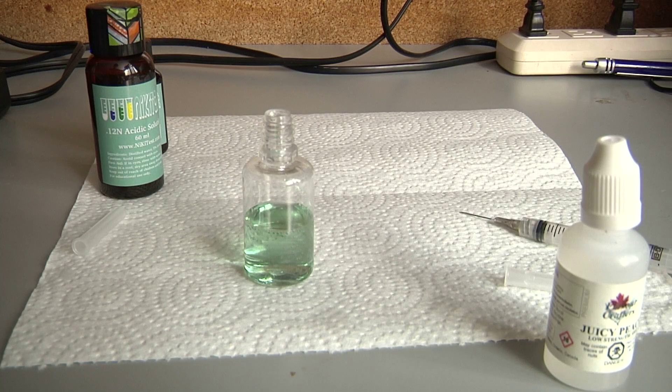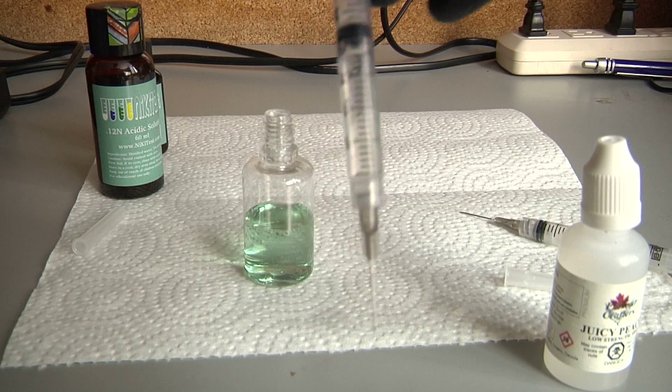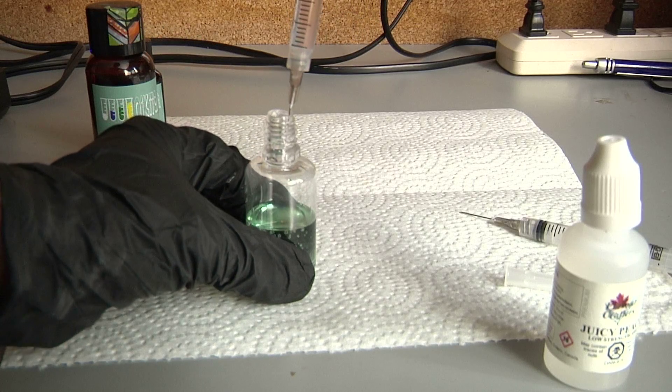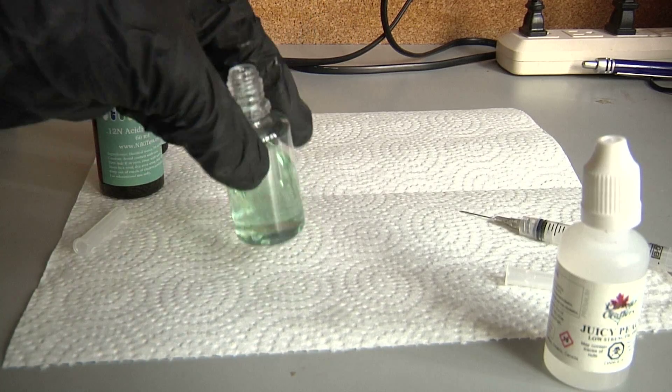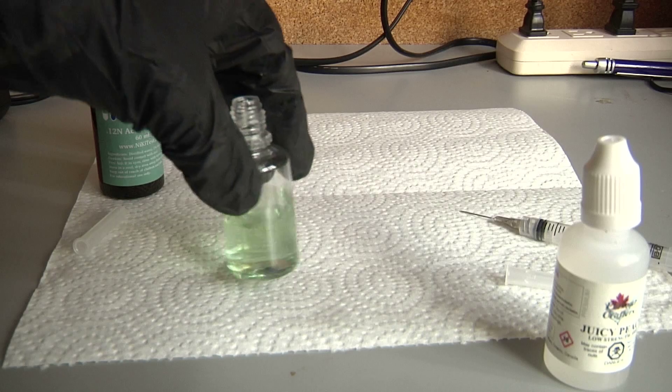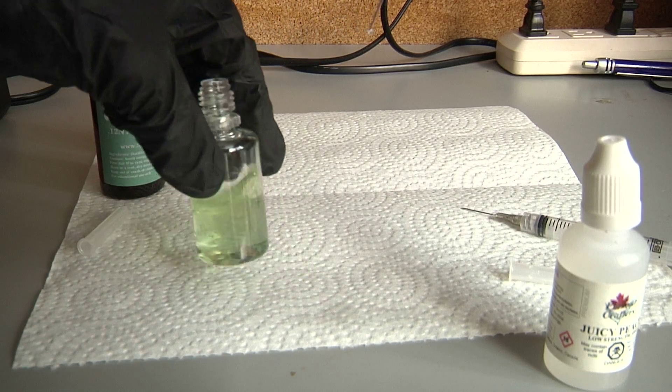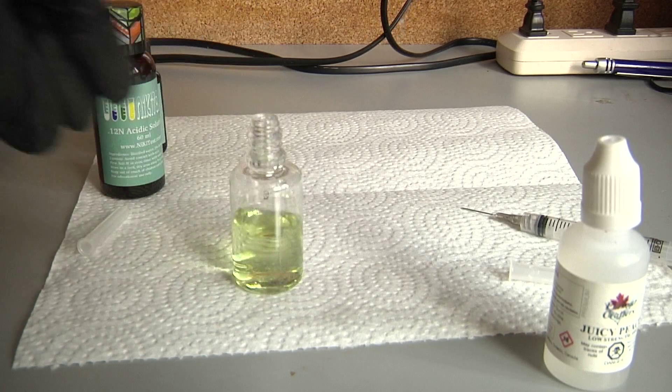You may not be able to see that on camera — I'll add a little bit more. Yeah, I don't know if you can see that on camera, but that's a lot greener than the blue, so I'll stop there. It's at green and I still have some left. Step eight: continue adding the acidic solution until it turns from green to green with a yellow tint. So we're just going to keep doing this — adding it. There we go, green with a yellow tint. It kind of looks just yellow on camera but it is green with a yellow tint.